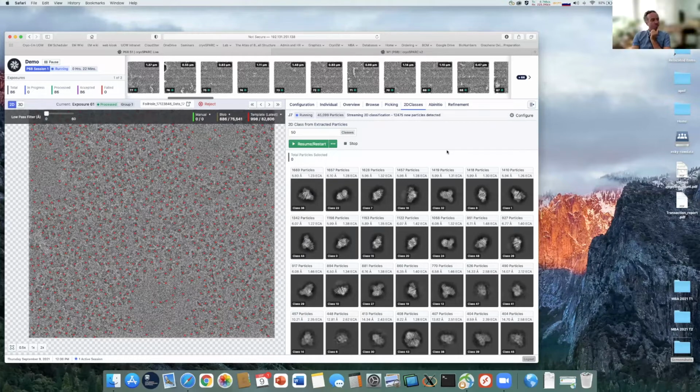I think once you have, I would say 4, then that would be correct. Yes. So the GPUs themselves don't have to be ridiculously fast. It's not worth spending the money on the top of the line 3090 or whatever GPU is currently the hot stuff. These are older GPUs, but because we have the fast storage, it's quite quick.